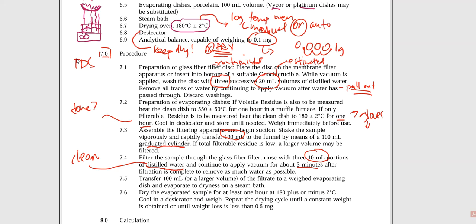All right, well, distilled water should be clean. It should not have any type of residue that will be present. If I did distilled water in this test, I should be getting hopefully 0 for a residue number. There shouldn't be anything there. It's just like reverse osmosis water. If I did reverse osmosis, there should not be anything there. All of that water will evaporate and there is no residue left behind because there was nothing dissolved in it. It was straight up H2O.